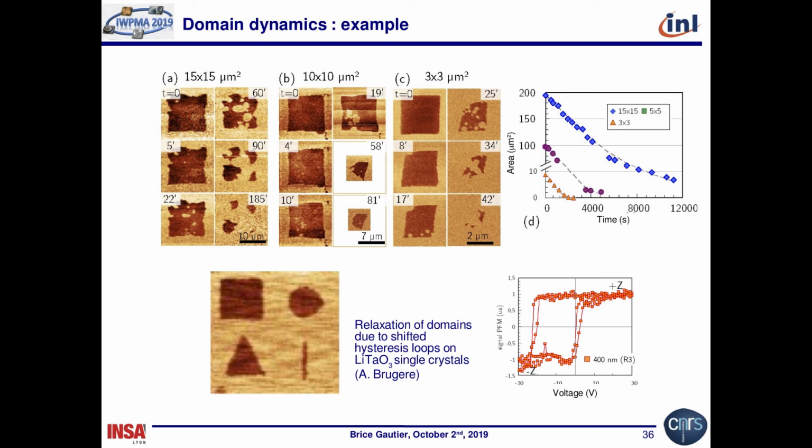completely. This is the same for this one. This is the same for this one. So even though PFM is a slow technique, you can still have some information about the domain dynamics. It is not sure that the tip itself does not play a role in the flipping back and the behavior of the domain, but still, you can have some information.